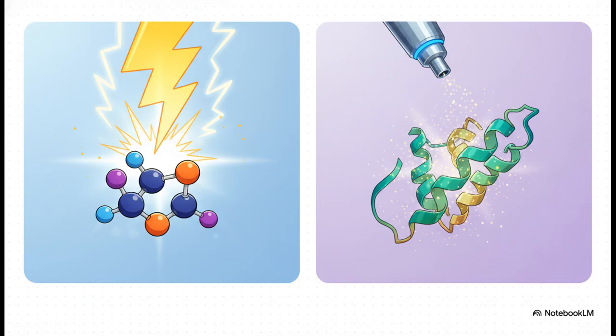But if we're dealing with massive, delicate things like biological proteins, actually, scratch that. A harsh beam would literally shatter them to pieces. So we contrast that with electrospray ionization, or ESI. It's a much gentler technique that is perfectly suited for keeping those larger biomolecules intact.